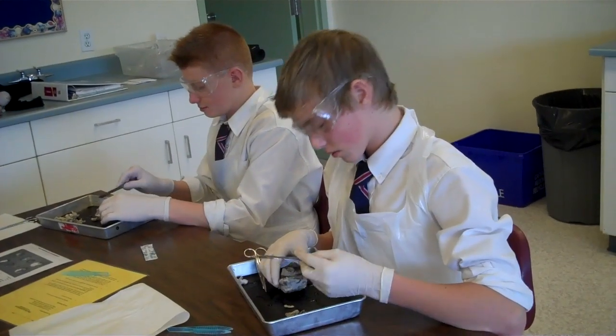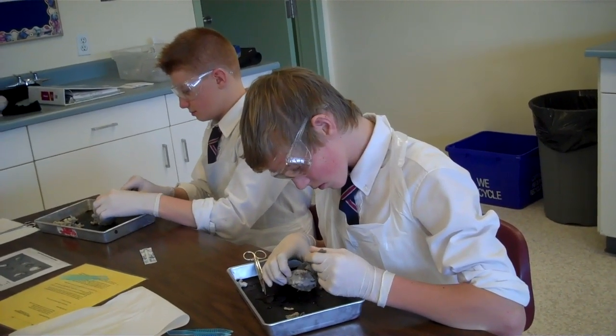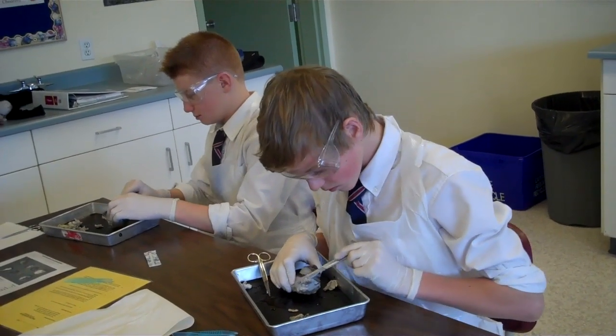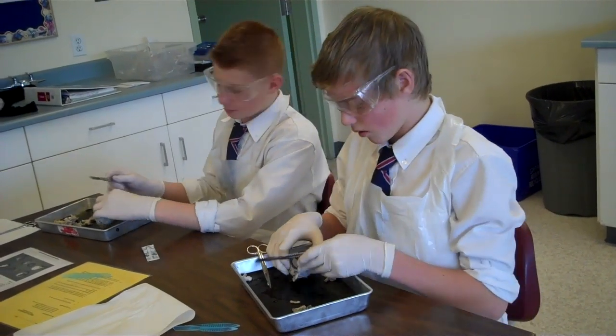The first thing I want to look for is I want you to find the aqueous humor after you've already trimmed your fat. Aqueous humor is right underneath that cornea. So you've got to cut it with your scissors. You can take the cornea away that way.